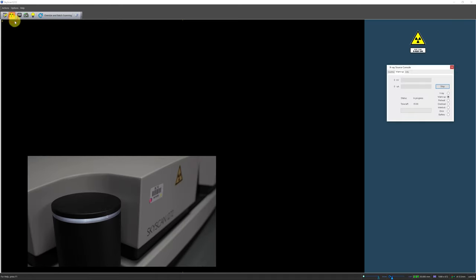After the control software has been turned on, let's first check the status of the x-ray by a single left mouse click on the x-ray on/off icon on the toolbar. After clicking the x-ray on/off icon, the x-ray source will be switched on and an x-ray sign along with the voltage and current status will appear on the screen. When the x-ray source is turned on, you will also notice that the LED x-ray indicators on the isolation stands switch from solid white light to flashing between red and white.